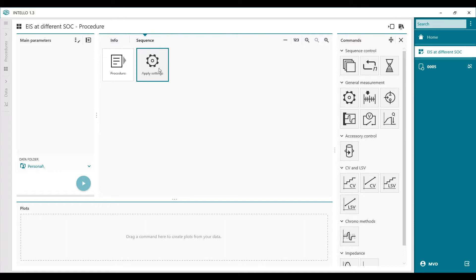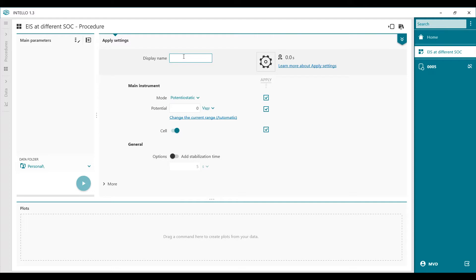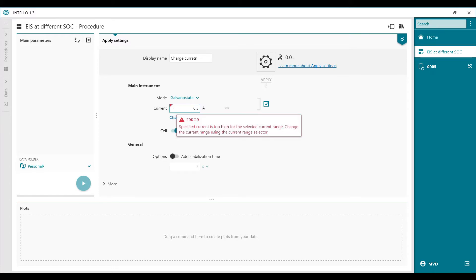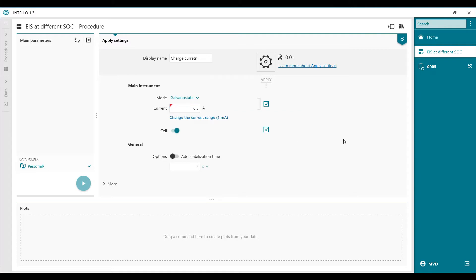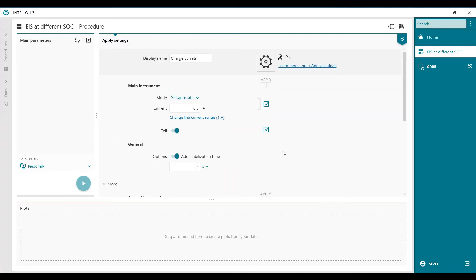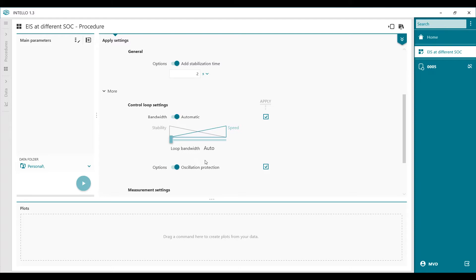In the first apply settings, we're going to define the charging current. We select it and set the charge current — we do that galvanostatically with 0.3 amps. A red error pops up, which means we have to modify the current range. The cell is switched on and we stabilize for two seconds. In the 'more' button we can modify the current range; we set it to 1 amp and the error message is gone. Control loop is automatic and oscillation protection is also on.